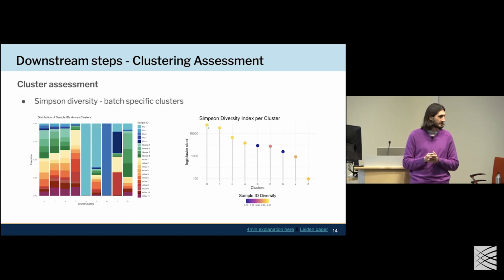But I'm going to go over some QC metrics in a little bit as well to try to help with that process. But again, I think if there's one point, it is that biology is the key driver of the decision making. We can provide as many parameters and tools and things to look at, but basing our decision making on the biology is, I think, the ultimate driver of what's going to make a successful analysis.